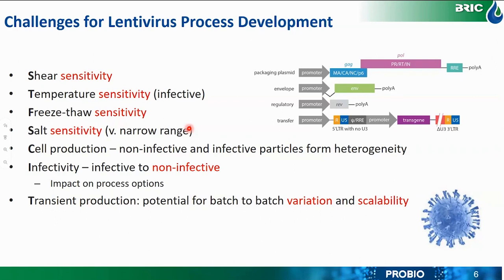During downstream purification, you need to consider the salt concentration, because high salt concentration may impact the functional titer of the viral vector. Also, the infectious particle count for the final product.